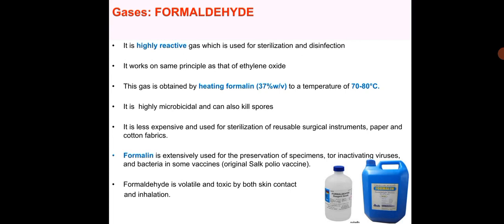Formalin is extensively used for the preservation of specimens, for inactivating viruses and bacteria in some vaccines, for example, in the original Salk polio vaccine. Formaldehyde is volatile and toxic to both skin contact and inhalation.